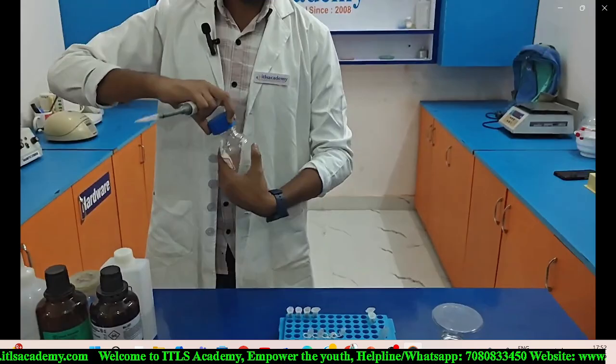After that, we discuss one more topic, that is isolation of the DNA from human saliva. So this is very easy. We don't require any chemical for this, okay? We just simply rinse it, and then after that we centrifuge it in a repeated manner until we get the DNA. So first of all, I will explain to you, then I will show you the experimental video.